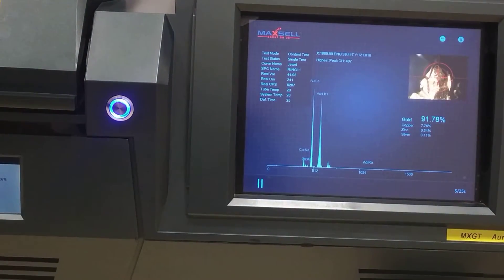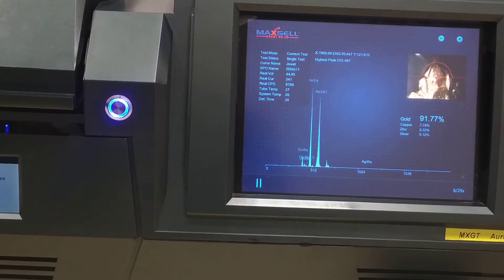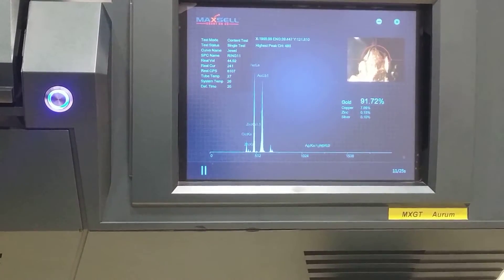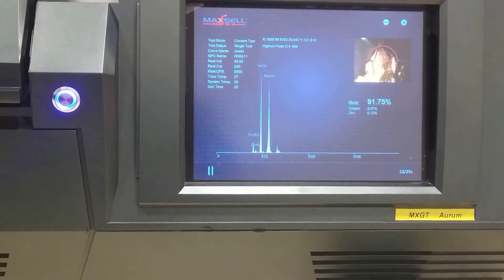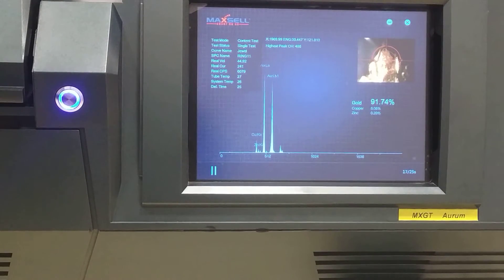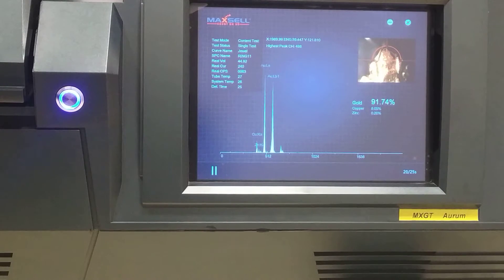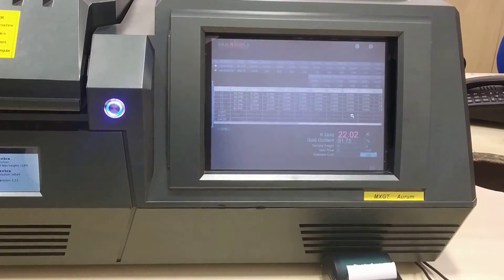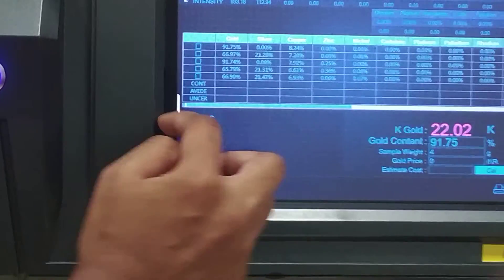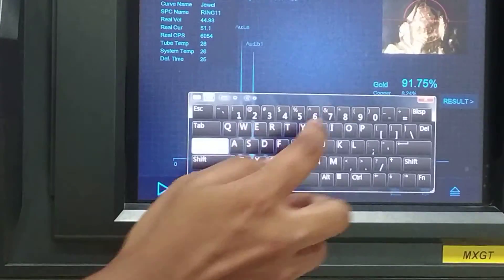We are taking only 25 seconds to check it, and since it is 22 carat, it is showing 917 within 10 seconds. Right from the start you will know it is 22 carat.